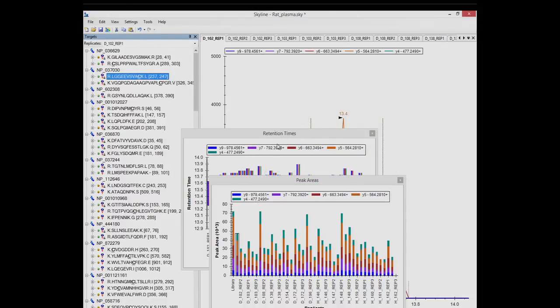I'm going to show you what I think is one of the more effective layouts for processing data like this, where you are going to do some manual inspection of your data. Even as we have better automated tools, it's incredibly useful to drill in and inspect things, and not just rely on something that spits out a matrix of information for you.